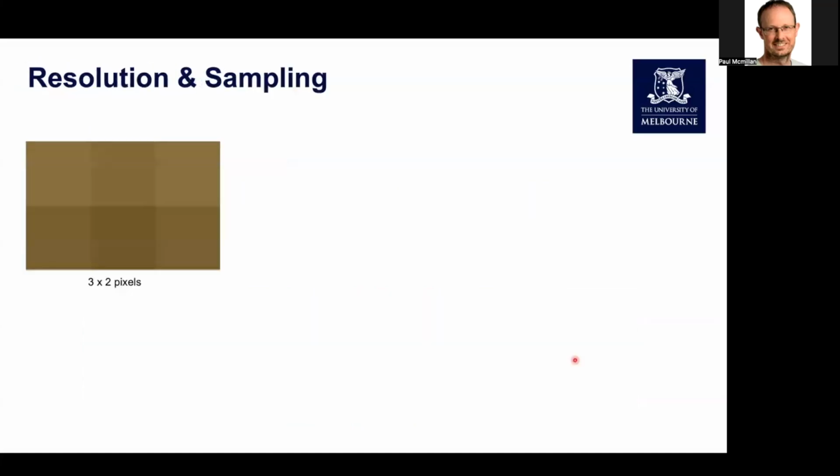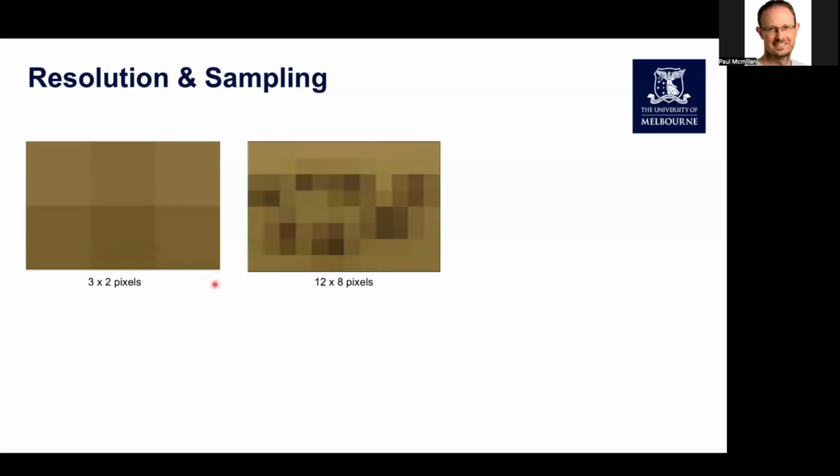So one little thought exercise for you to think about is that you've been looking down your microscope and you can see some objects there and you want to count those objects. What we want to do now is capture that data into a microscope image, and we're going to set a number of pixels there to do that. Hopefully you would agree with me that on this 3 by 2 pixels, we can't see any of the information that we were able to see down the eyepiece.